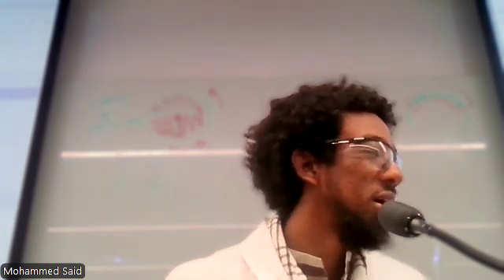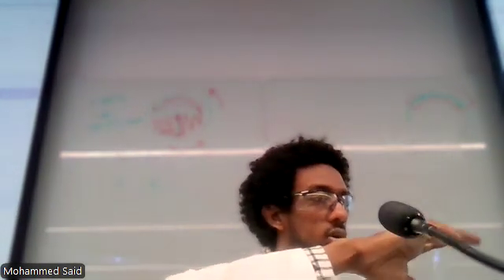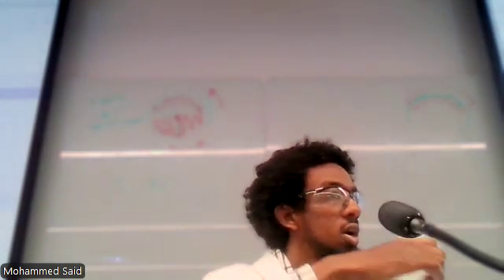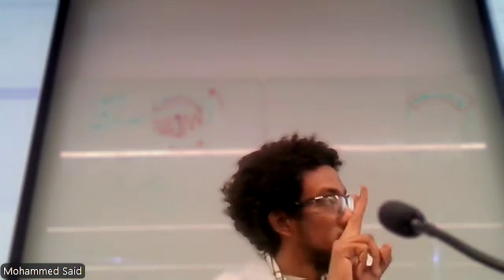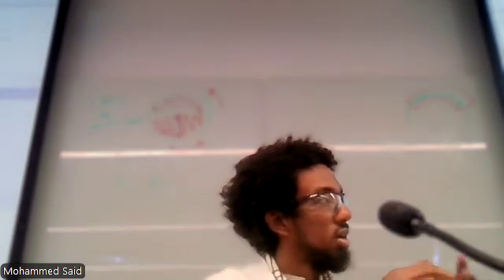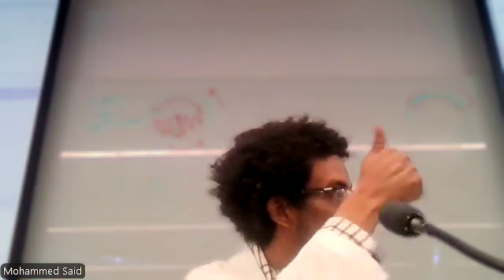Thanks a lot. So in about 20 minutes, we're going to take them out, and 20 minutes from now, they're likely going to form a pellet. So just like how we did it before for the other bacterial species, HT99 and J53R, we have to resuspend them because they're now ideally supporting conjugation between both bacterium. So we want to make sure that we get them all in that resuspension and not at the end of the pellet for spread plating, or sorry, spread plating with the swab.